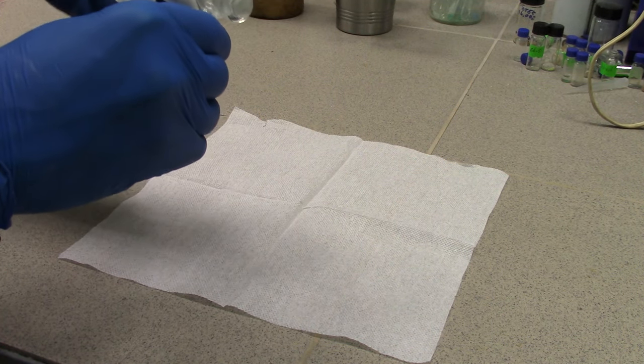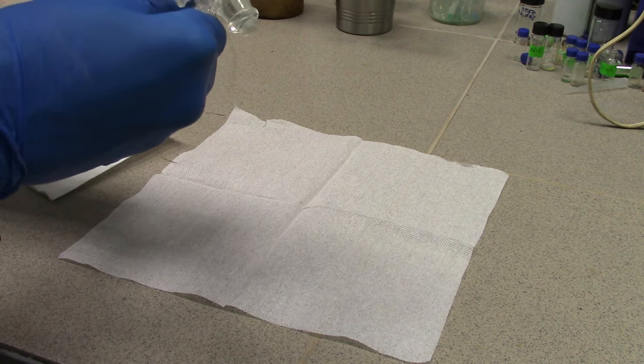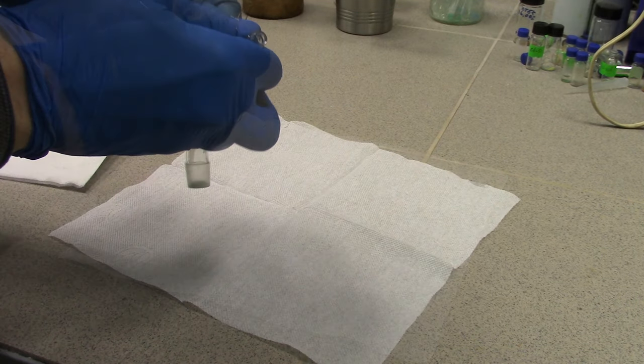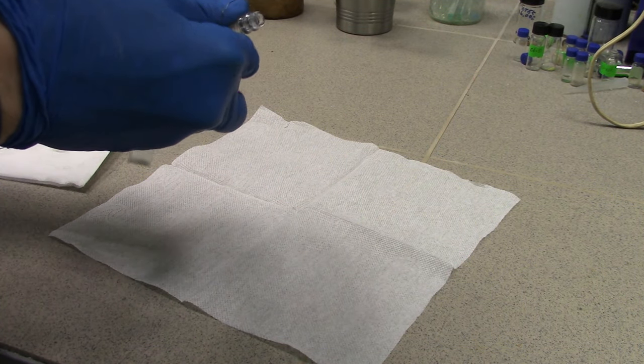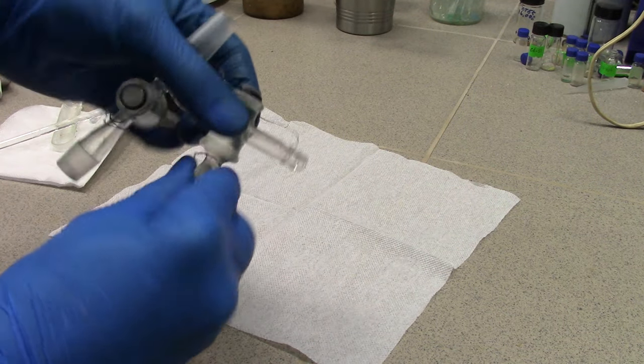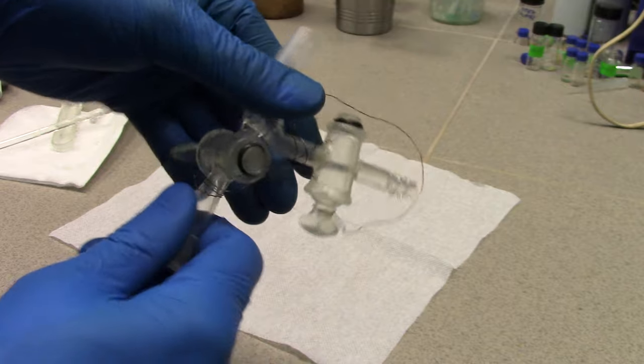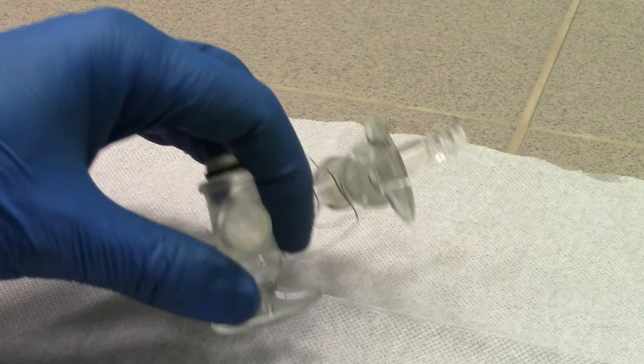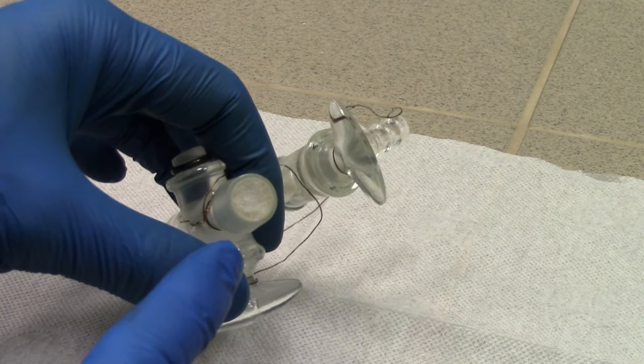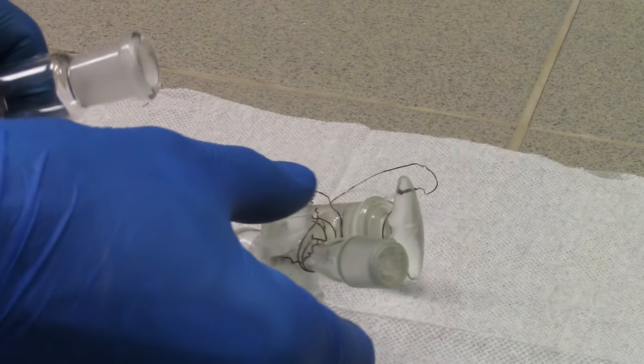Taps are linked with backbone wire because pressure gap between vacuum and argon from balloon or inert gas line could easily shoot them to the sidewinds. Outlet contains 14mm joint equipped with porous glass filtering surface. Other joint must be covered by an empty well-dried round bottom flask.